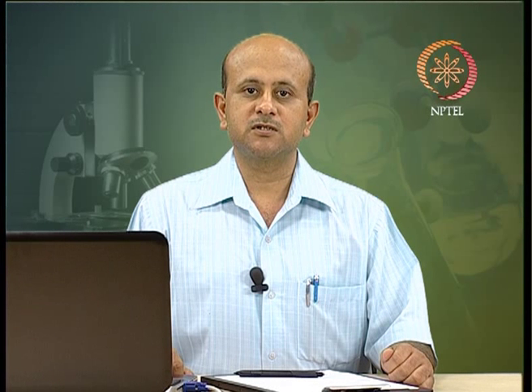In this lecture, we are going to extend our discussion to the different types of centrifuges, types of rotors which are used in these centrifuges, and then the care and safety aspects of centrifuges as well as the rotors used in them. So, we will be discussing all these things in coming lectures. In this lecture, we are going to discuss the different types of centrifuges used for various applications.